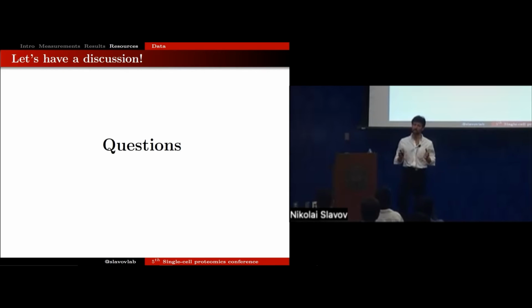I particularly like the pipelines that allow you to change various choices of analysis steps and see what the result of that is. I think that's very powerful and very useful. Simple, but useful. Also good things. As it scales further, we certainly will need to scale those pipelines. I don't see that as being a major challenge. I think it's an important problem to engineer and solve well, but we can also piggyback and take advantage of many of the solutions for single-cell RNA sequencing that have already experienced this challenge of massive large-scale data sets. And much of that infrastructure, many of those solutions can also be adopted to work with proteins.